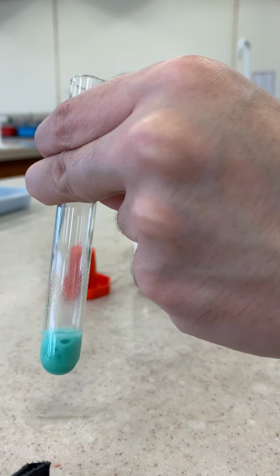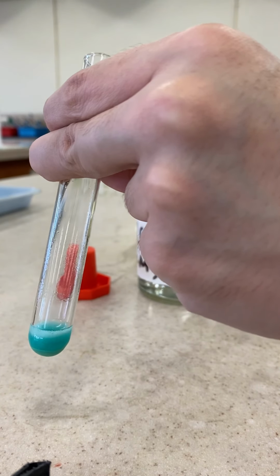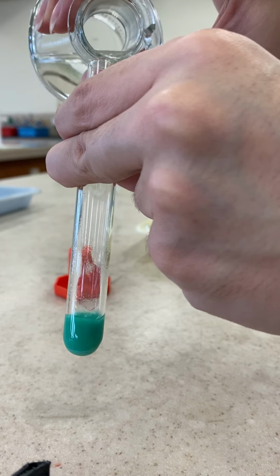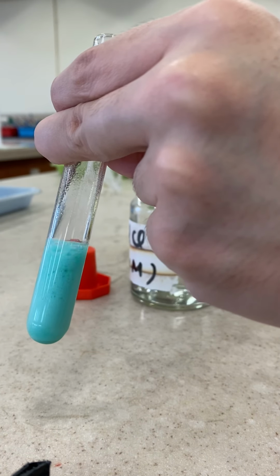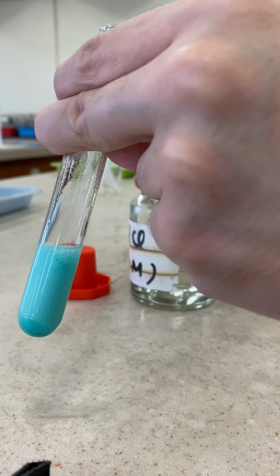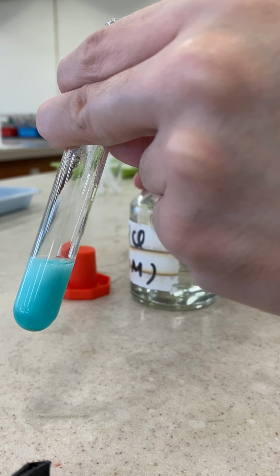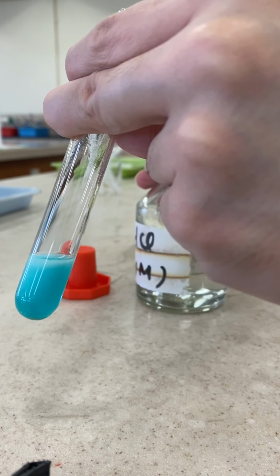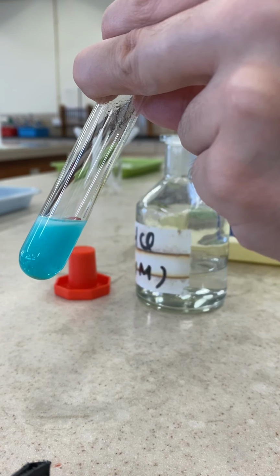I think you can see something already. Some gas bubbles evolve. And then add some more. Give it some time for the reaction to take place.